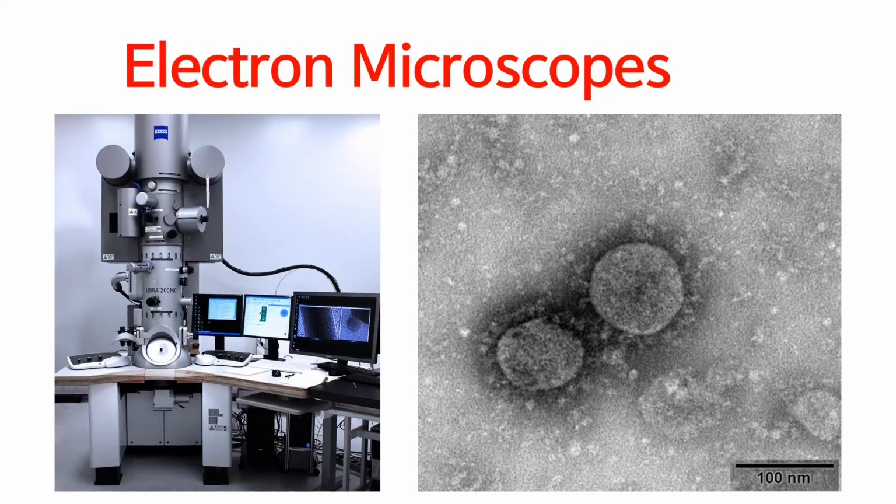We need an electromagnetic wave to see the object. There are two ways to observe the object. One way is to see the object by detecting the electromagnetic waves reflecting from the surfaces of the object. This is how our eyes see the object. Our eyes collect the visible light reflected from an object surface, and the brain uses this light to create an image.